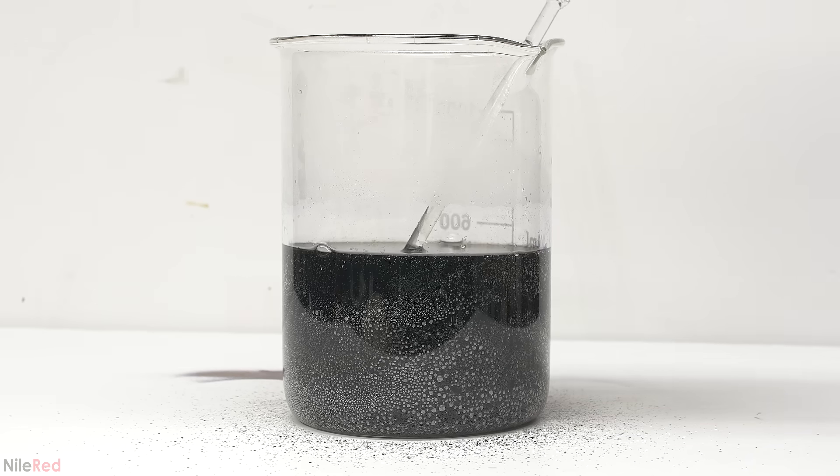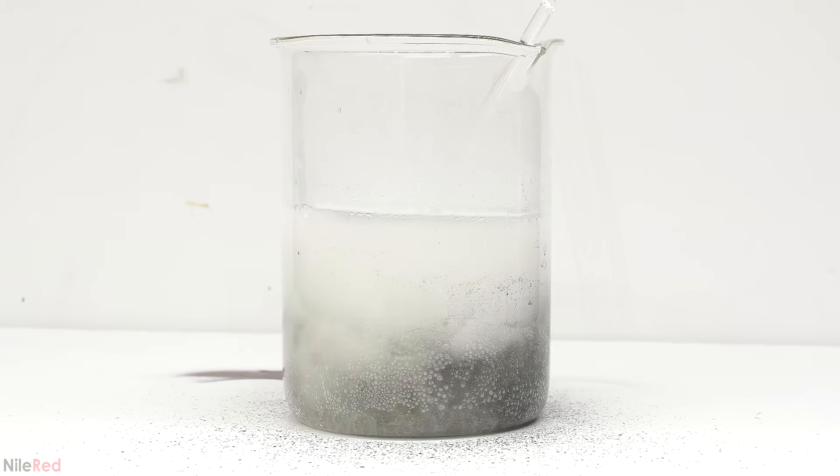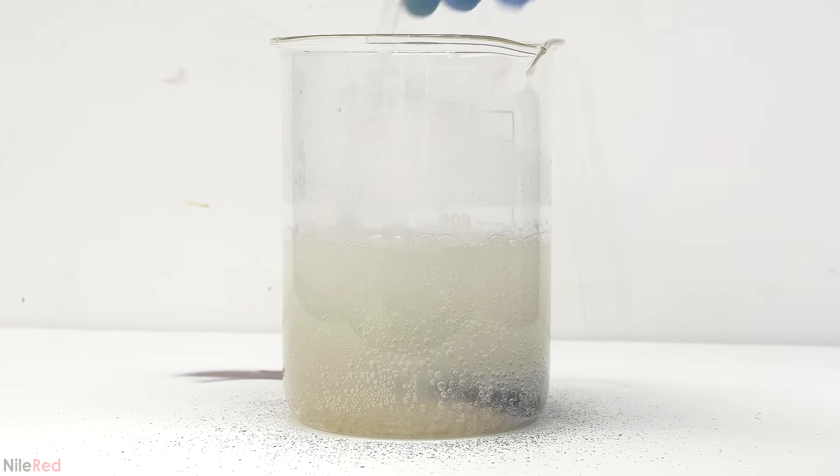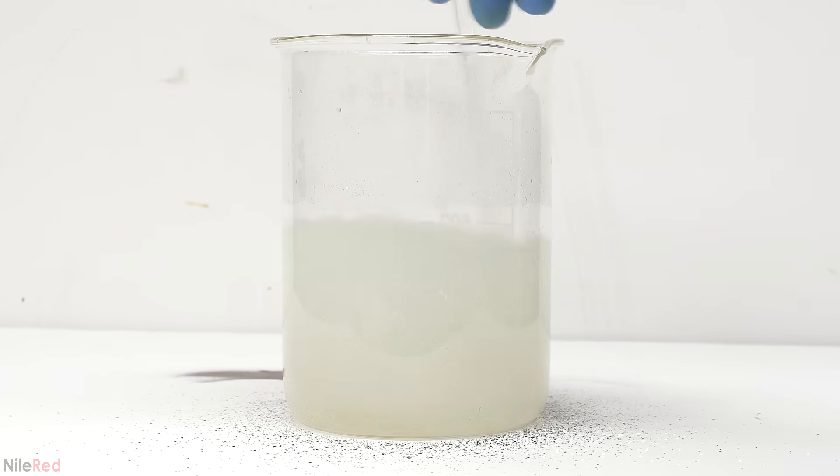I was running out of space in this small beaker, so I switched to a 1 liter beaker. I started just adding solid sodium thiosulfate instead of dissolving it first. Eventually I've added enough, and the solution stays colorless. The next thing that I need to do is remove the manganese from the solution.